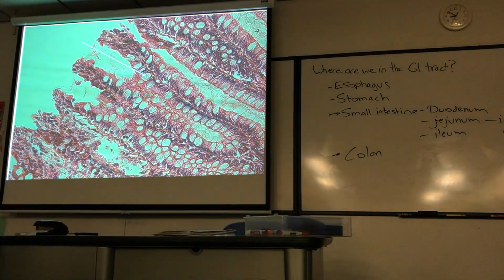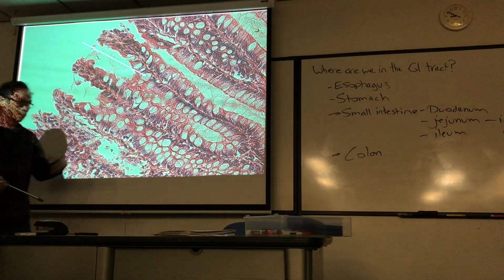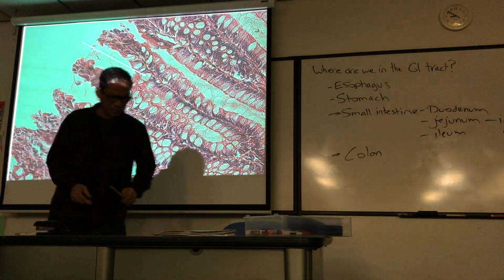The striking thing about the colon are the goblet cells. The goblet cells. I point to 1, but they're all over the place, right? The goblet cells have a very important function to help keep you regular.